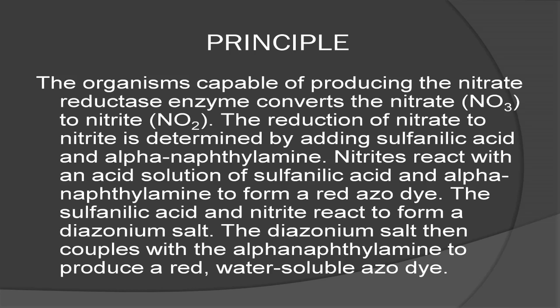The development of the red color on addition of zinc indicates that nitrate was not reduced by the organism, which suggests that the test organism is not capable of reducing nitrate. If no color change occurs after the addition of zinc, this indicates that the organism reduced nitrate to one of the other nitrogen compounds and thus is a nitrate reducer.